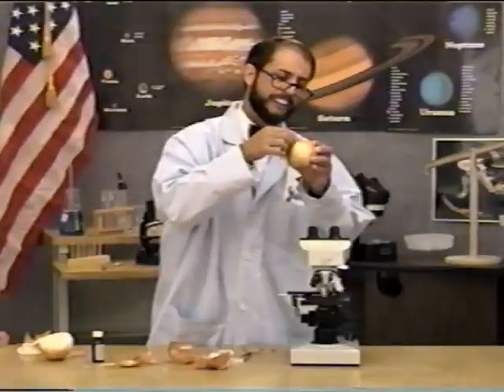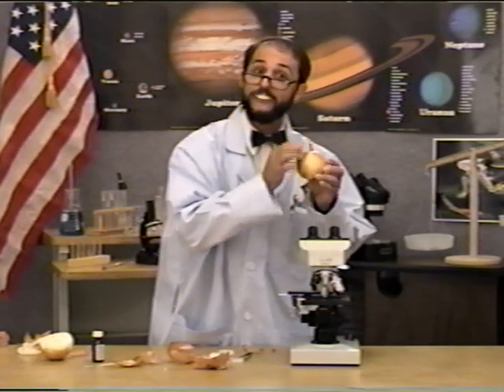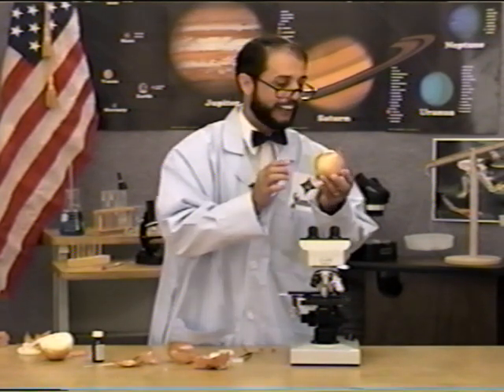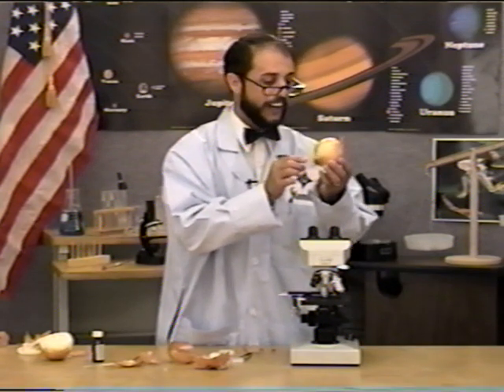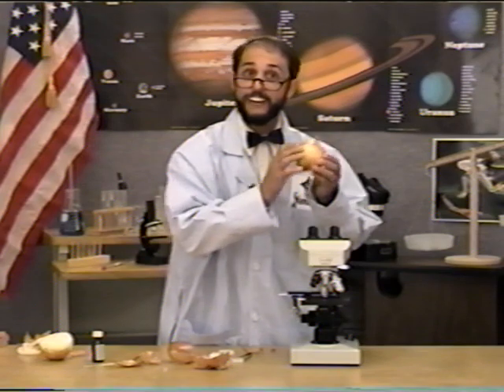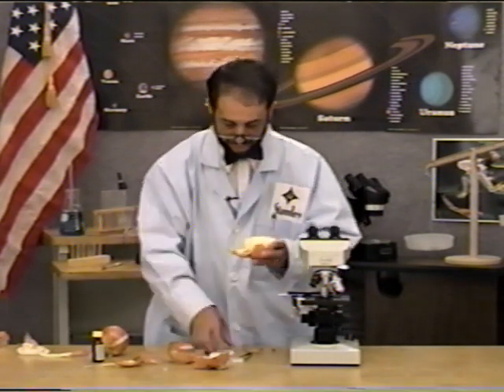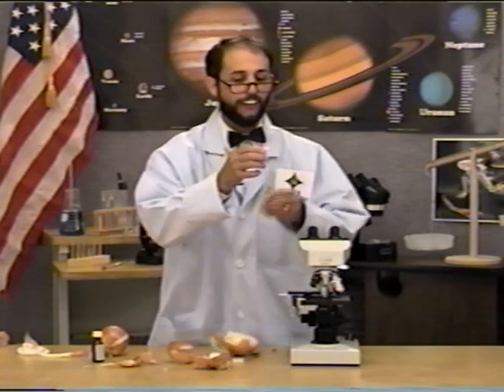Now, this one doesn't have very many leaf cells on it, so we won't try to make a sample out of that. However, if we cut carefully into this onion's bulb, we can come up with a piece of the bulb.